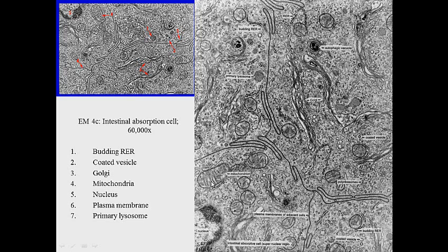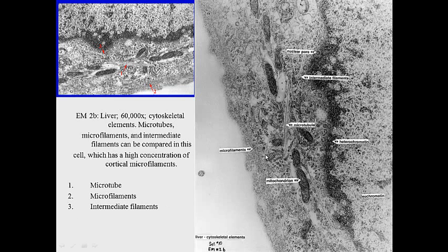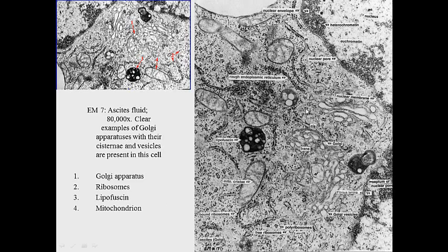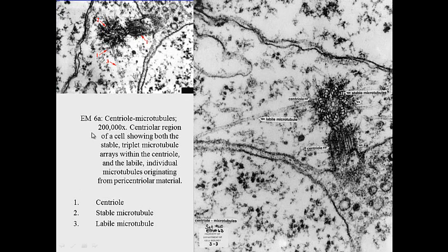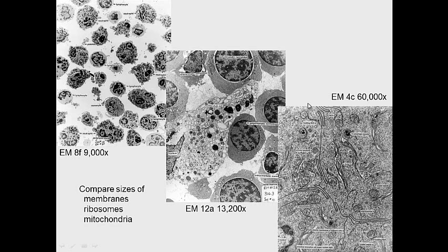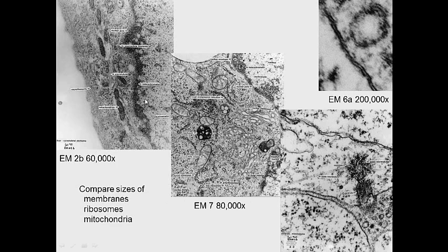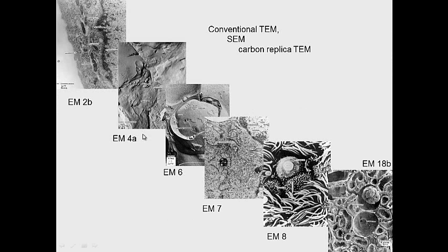At 60,000x magnification the mitochondria are well-defined and microtubules, microfilaments, and polyribosomes are visible. Jumping to 80,000x, ribosomes are quite large and mitochondria larger as well. At 200,000x you can see the lipid bilayer clearly - two dark layers with a light center - as well as microtubules in a centriole. Following mitochondria or ribosomes across magnifications illustrates how increasing magnification reveals progressively finer detail.